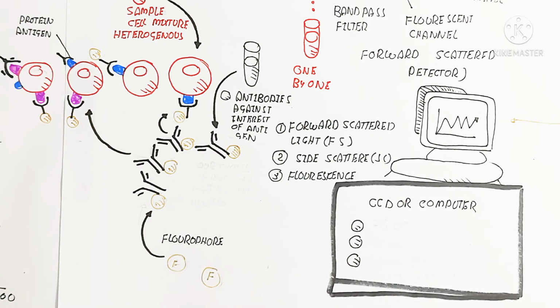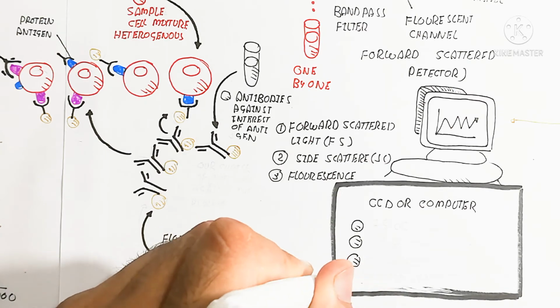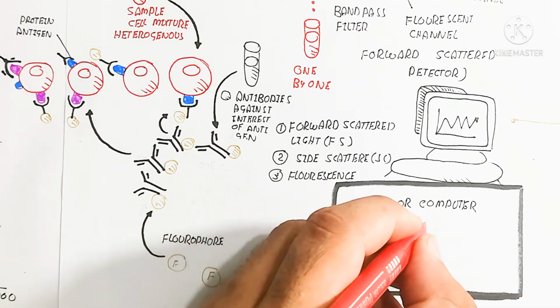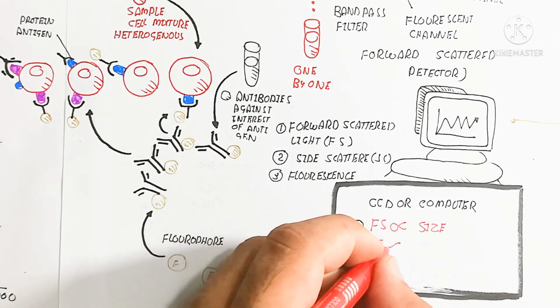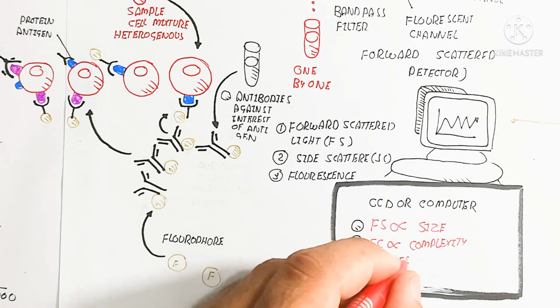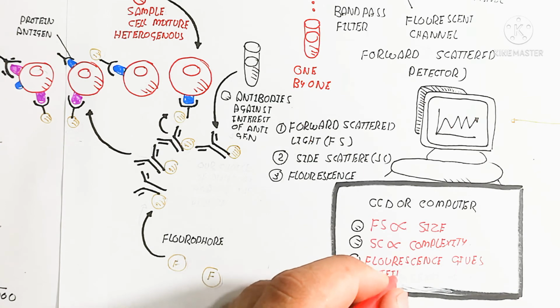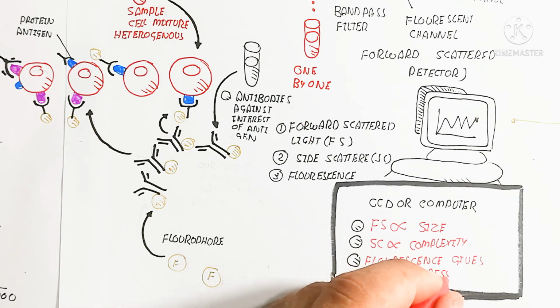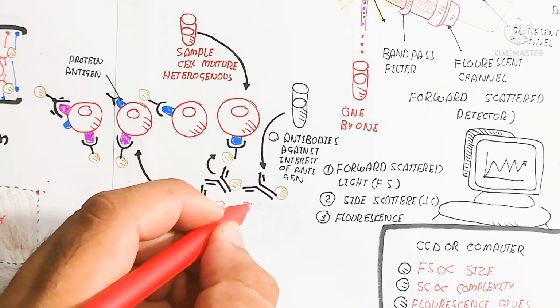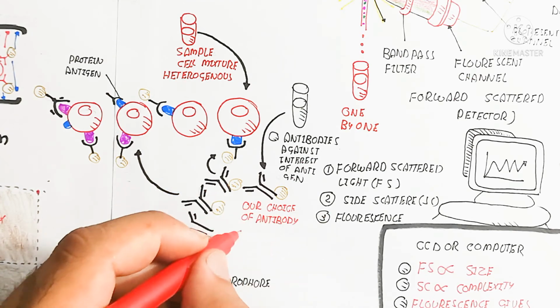For example, if red color is not showing on the PC, it means the antibodies related to the red color, to which the fluorophore is attached, are not present. After washing, they are washed away, so it means the antibody is not present. So here is our choice of antibodies against the protein, so we can detect it. If it does not bind with the cell, no color is produced. So that is the thing. I hope it makes sense.